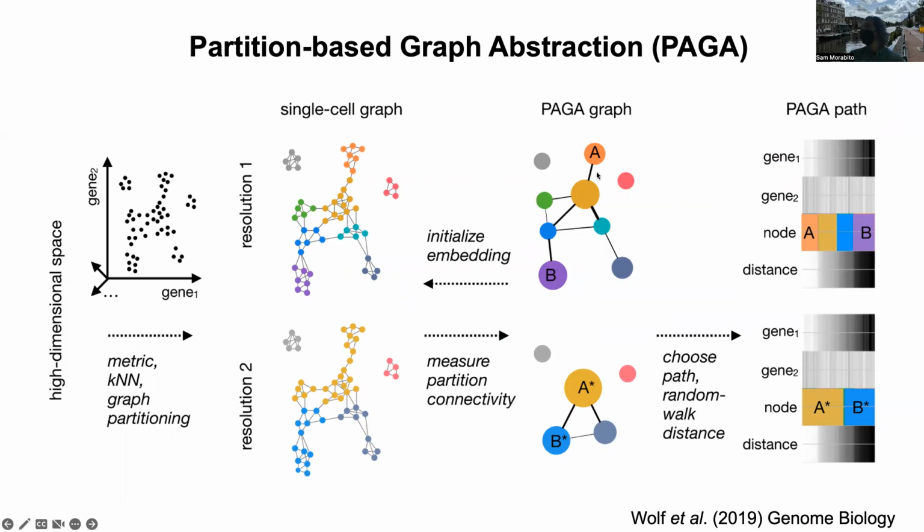Then they take that graph and apply some kind of diffusion method to compute the pseudotime based on what you call the root. Overall it's a really fast algorithm, and it's built into a tool that a lot of people already use. So that's a good one for sure.